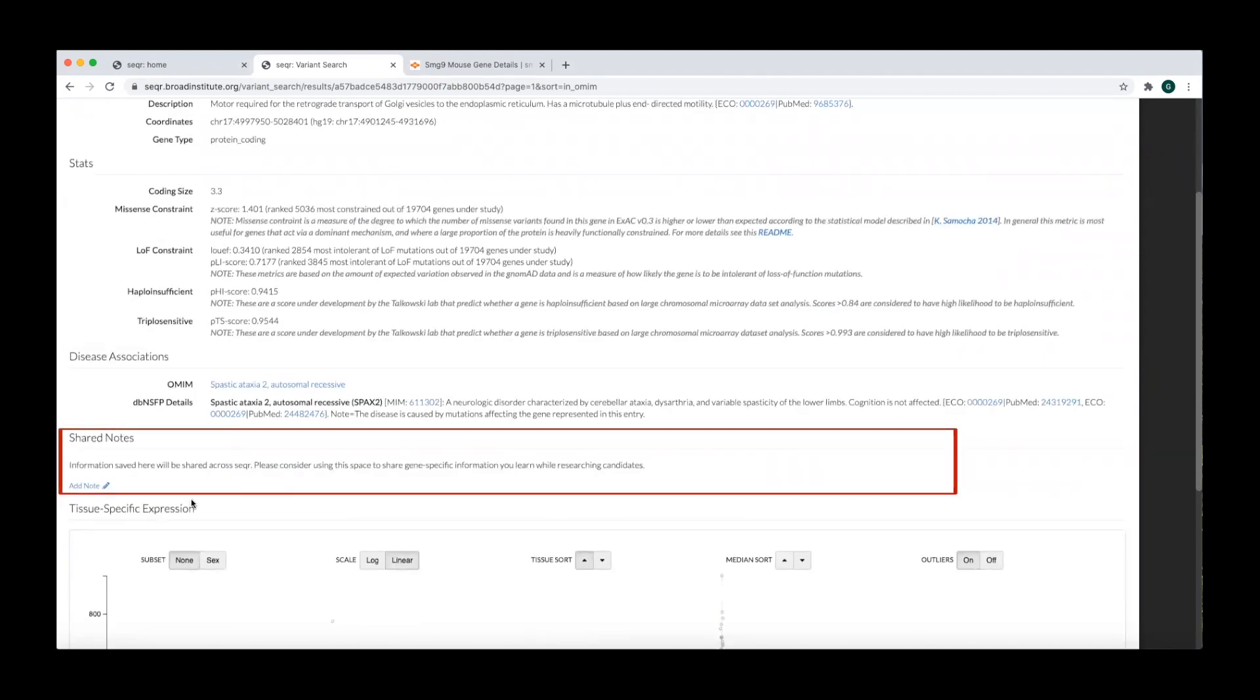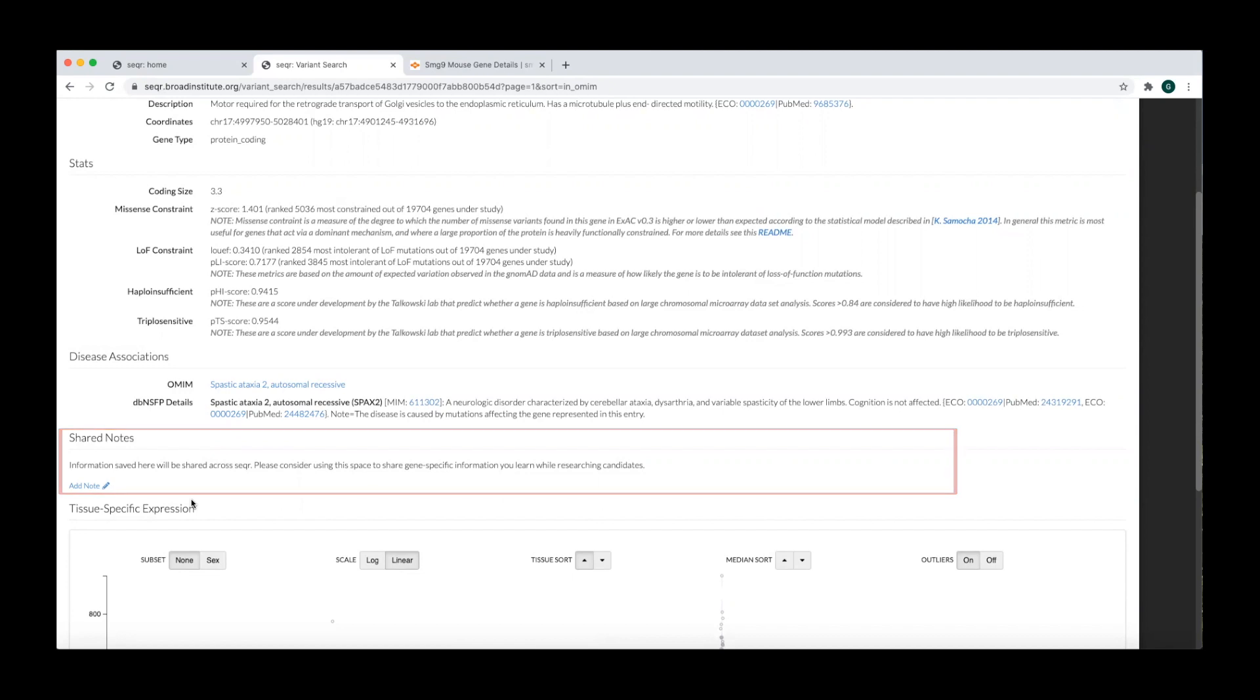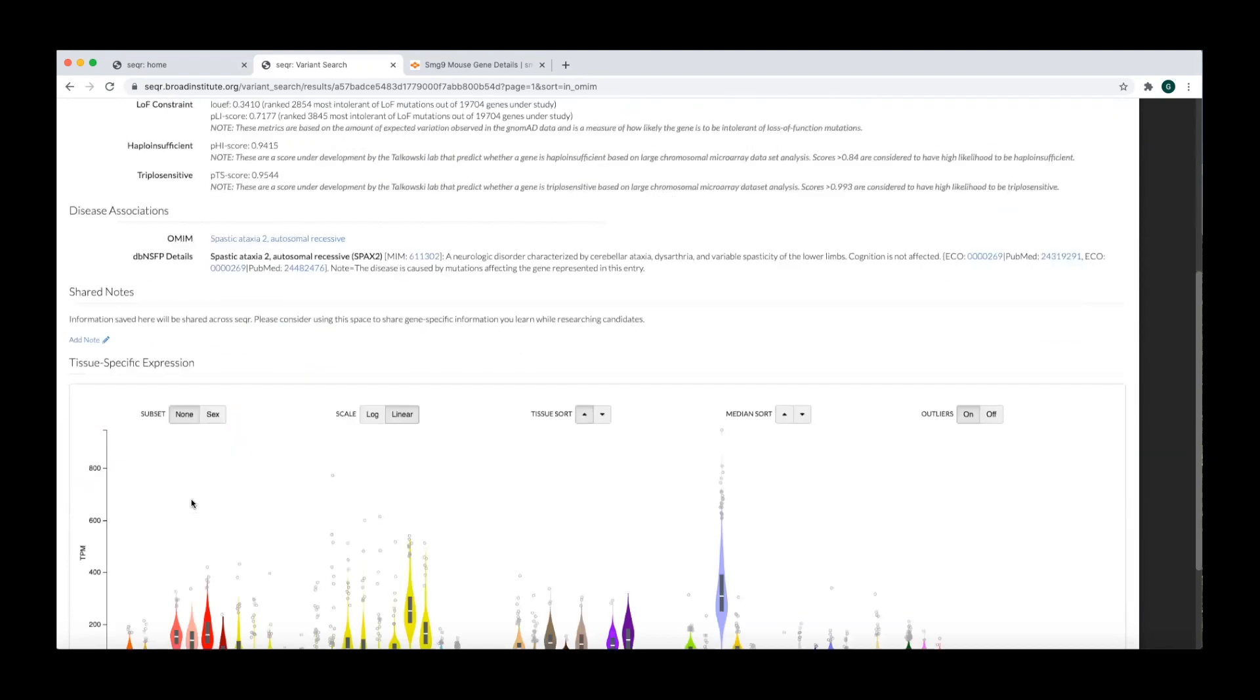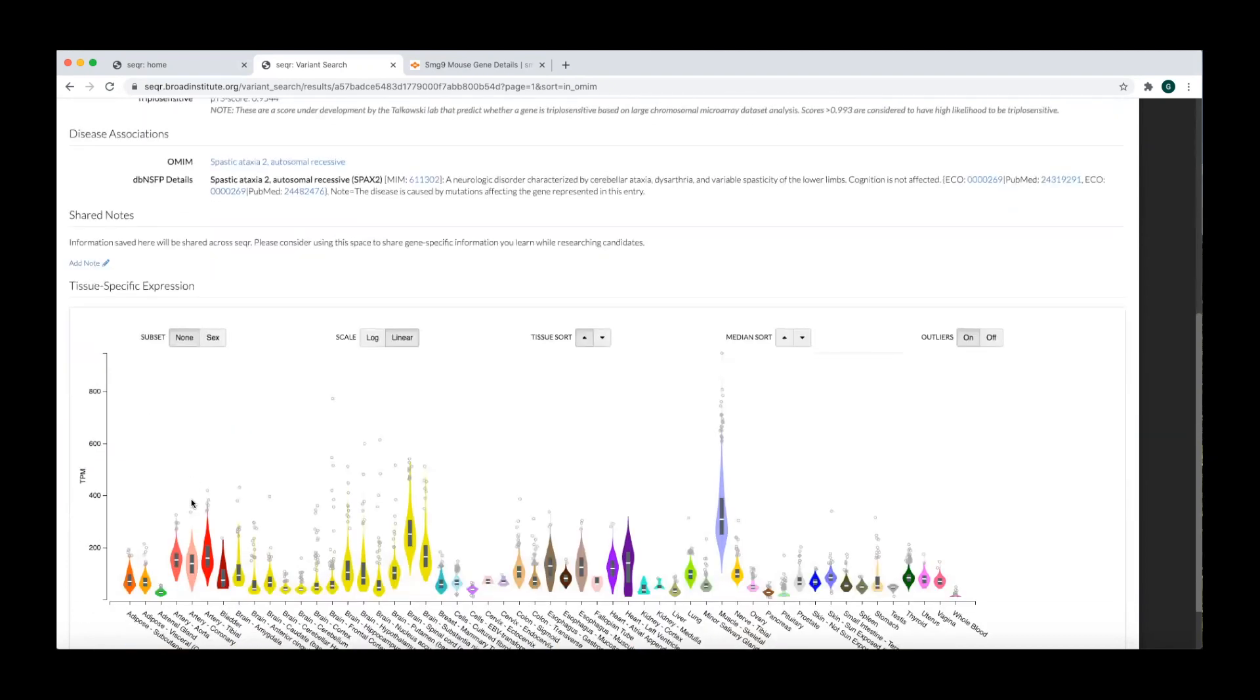The shared notes section allows anyone to add gene information to be shared across all Seqr users. This is a good place to summarize and cite papers supporting gene disease associations. If you are working on a gene, feel free to share that information and your email address if you would be interested in people contacting you about interesting variants or cases.